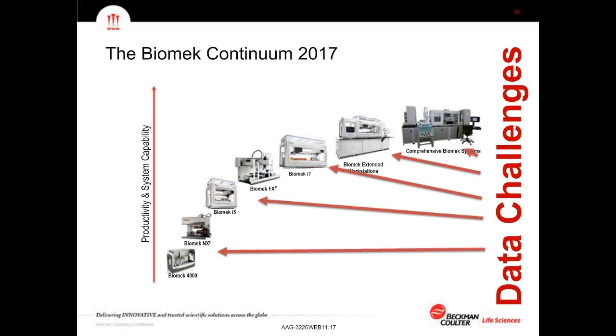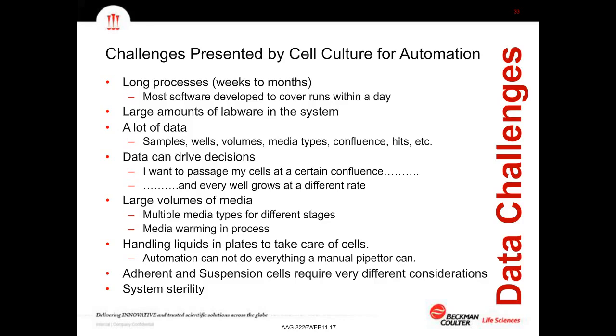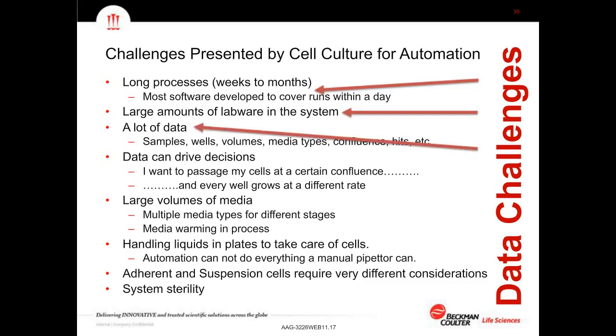Again, reiterating the list of challenges that Russell prepared for you, there are a number of data challenges that are intermixed with the sample processing challenges. The fact that we have long processes that run from weeks to months, maintaining an understanding of the traceability and the information being processed is important. Having a large number of plates in the system adds layers of data which just accumulate: samples, wells, media types, concentrations. You want data-driven decision making. And then handling liquids and driving pipetting, hit picking, those are all elements that come into the data domain.